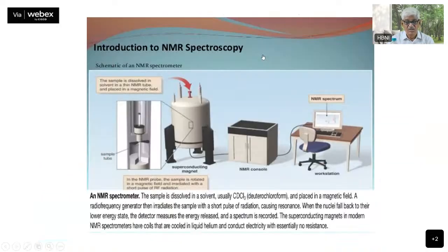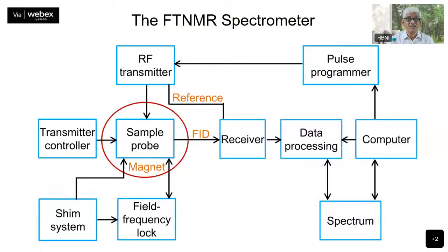Okay, so now we have finished the module 2 topics up till now. There were some additional lectures which are essentially supposed to be laboratory experiments, hands-on, but that is not practical in this kind of an online session. So what Dr. Paul wanted to do is to give instruction to simulate the environment of the spectrometer and all the things which are of practical importance.